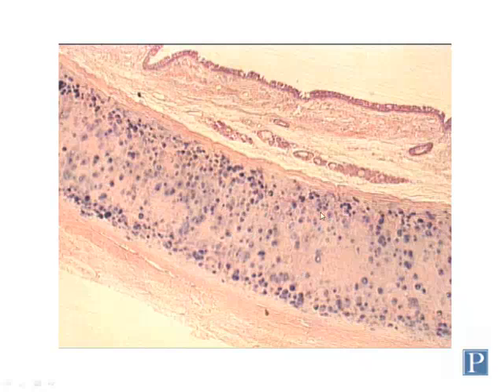So in this section we have trachea. Here you can see the epithelium of the trachea, which is composed of PCCE we talked about before. Here's some connective tissue underneath that. Here you can see some glandular tissue. We're going to look at those later on.